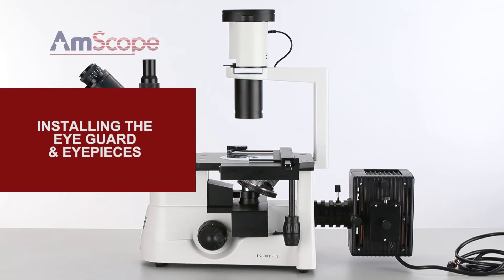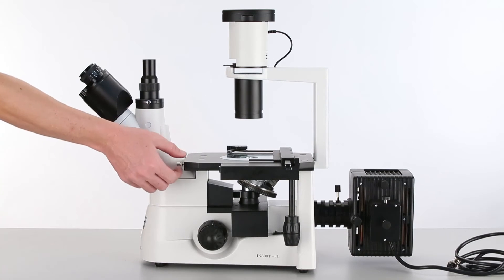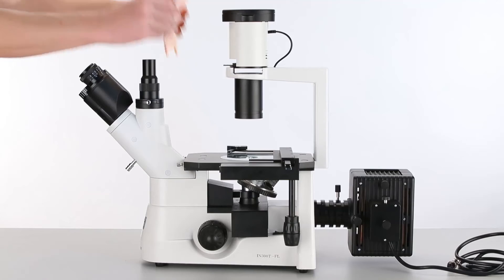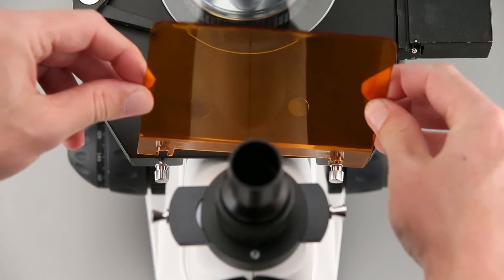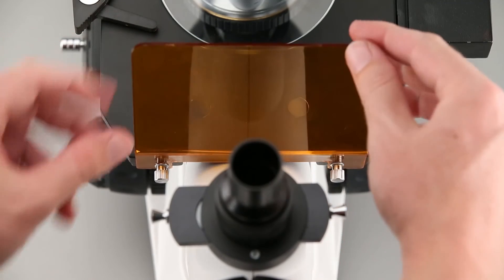Before using the episcopic lighting, it's important to attach the eye guard, which filters light from the stage to prevent damage to your eyes. Start by loosening the screws on the front of the stage. Next, insert the guard with the flange pointed towards the stage, then tighten the screws to secure it in place.